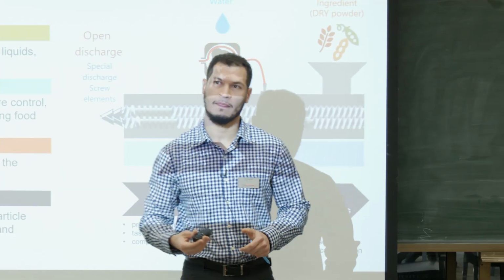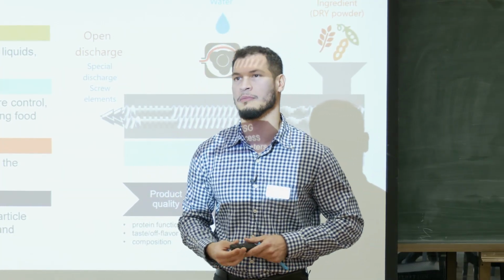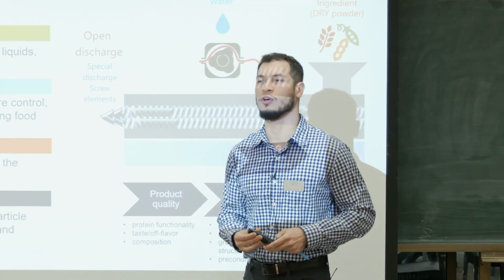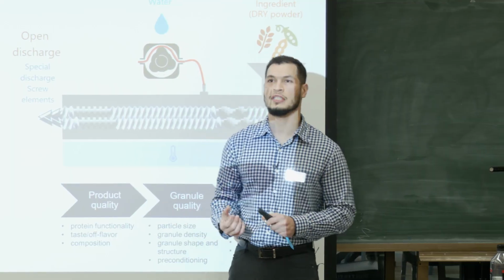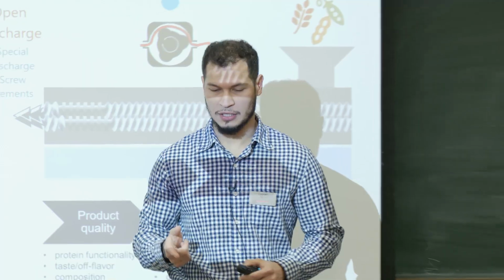What was the water content they used for the granulation? It depends, it can be 10%, it can be 15, but not very high. It should be less than 20. Yes, it's low because you just want to make granules. This is not a process, this is a preconditioning.